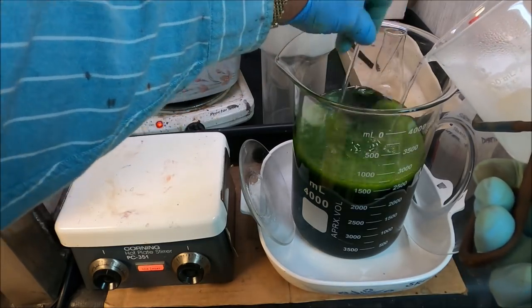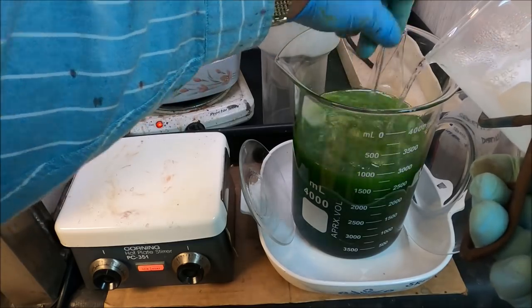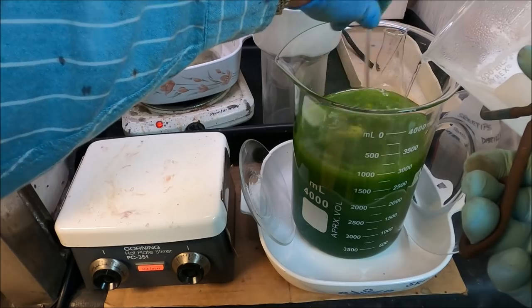You see the platinum and palladium coming out of solution. As soon as the DMG hits the solution, it turns yellow. That's the platinum group metals coming out of solution there.